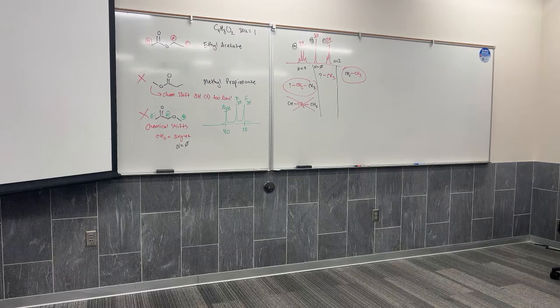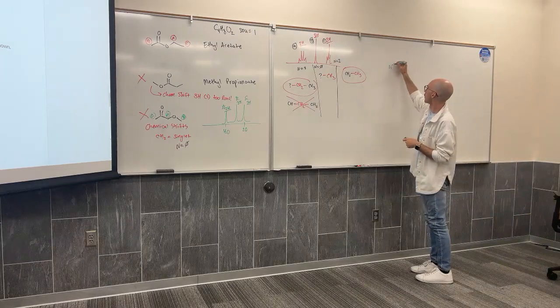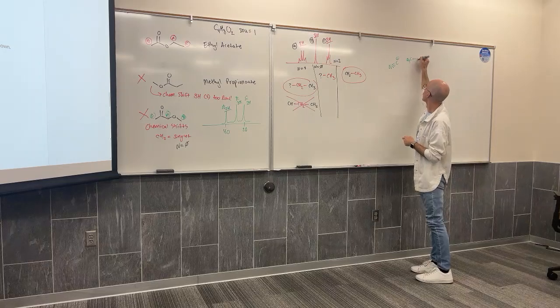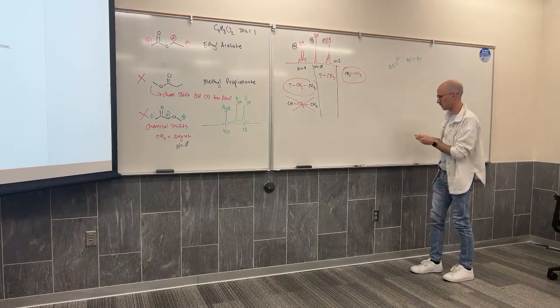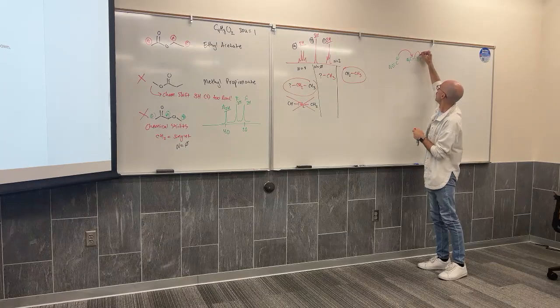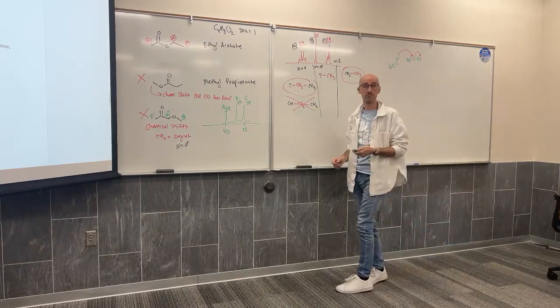Okay, this is taking us away from NMR, but just for a minute, and I'm okay with that. I'm guessing it would be a pretty short answer. You're looking at the arrow pushing? Okay. So I got almost the exact right answer that I wrote in the box, but on the key, there's a lone pair written in on the nitrogen, but there's not a lone pair in the original problem. Yeah. Why is there a lone pair in the product but not the reactant?